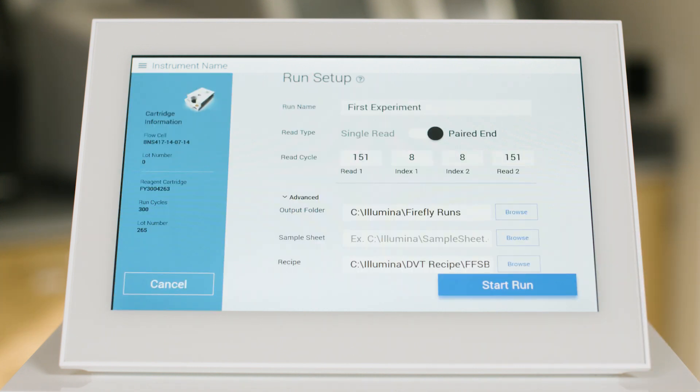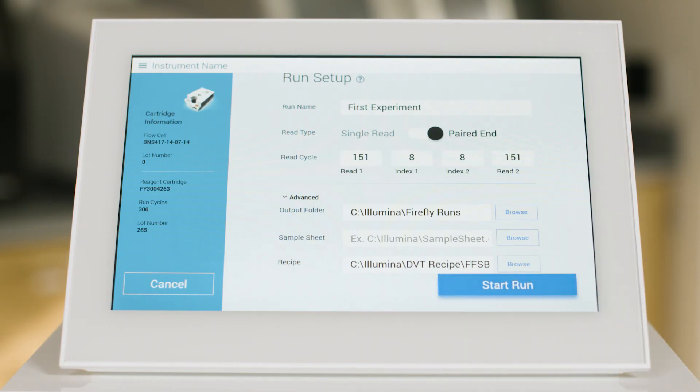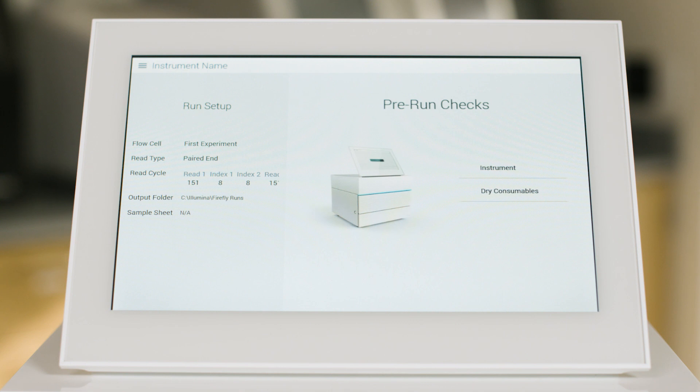While your cartridge is being initialized, you can enter in your sequencing parameters or access a previously configured run. Now you are ready to hit the start run button and begin your sequencing. The system will perform a quick pre-run check to ensure success. While your samples are being sequenced, you can follow up with your data in real time.